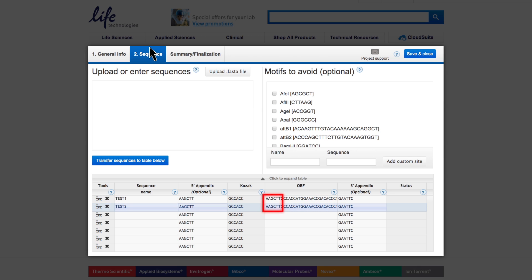If your sequence already harbors the flanking cloning sites, you can edit the sequence directly and cut and paste the sites into the appendix fields. Within the sequence field, you can switch from the 3' to 5' end by using the up and down arrows of your keypad.